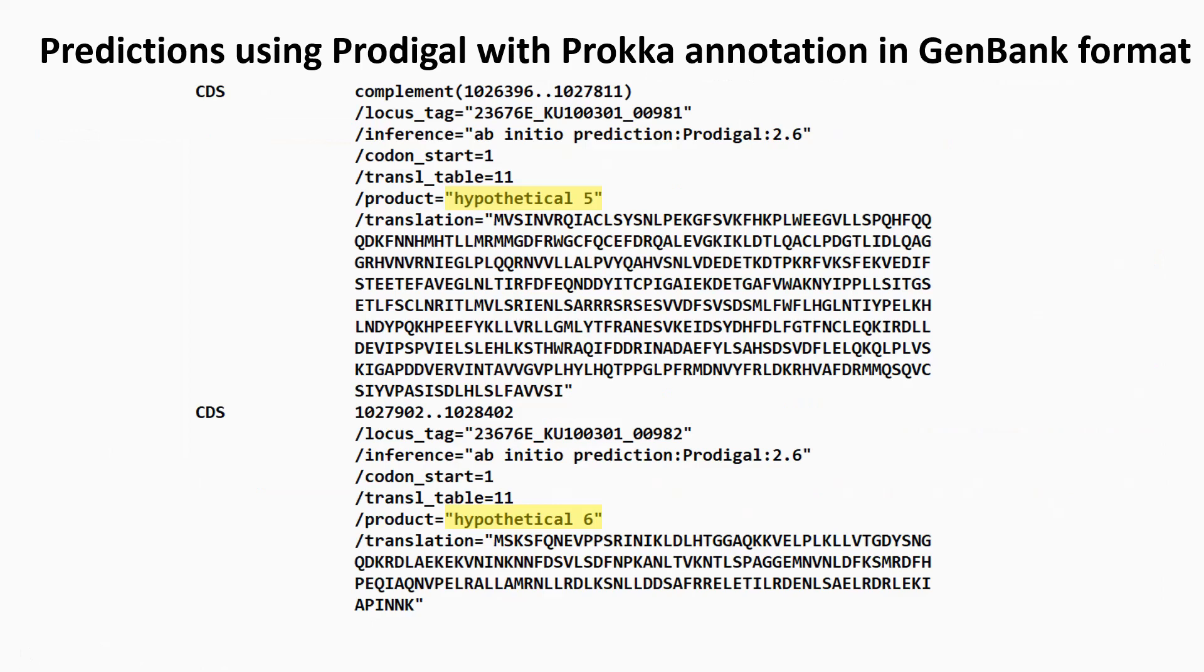I checked the annotations against an annotation that had been done with Prodigal, with a Prokka annotation. So as it was gene prediction Prodigal, an annotation using Prokka.